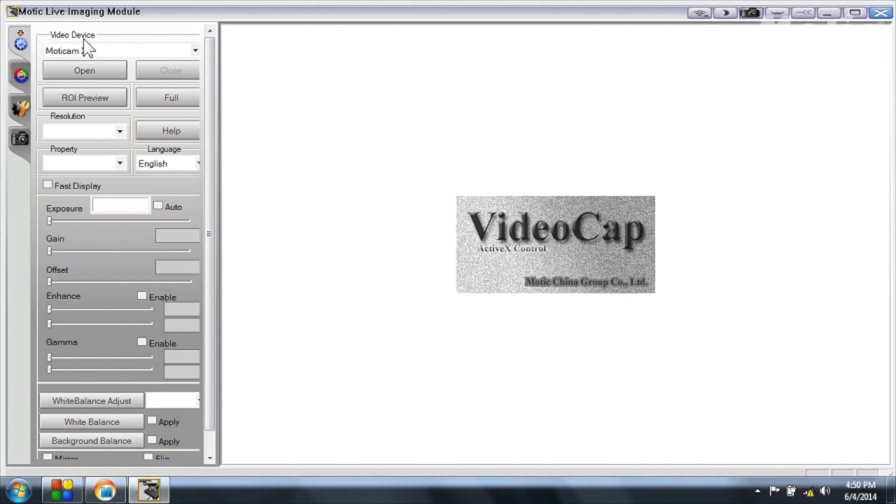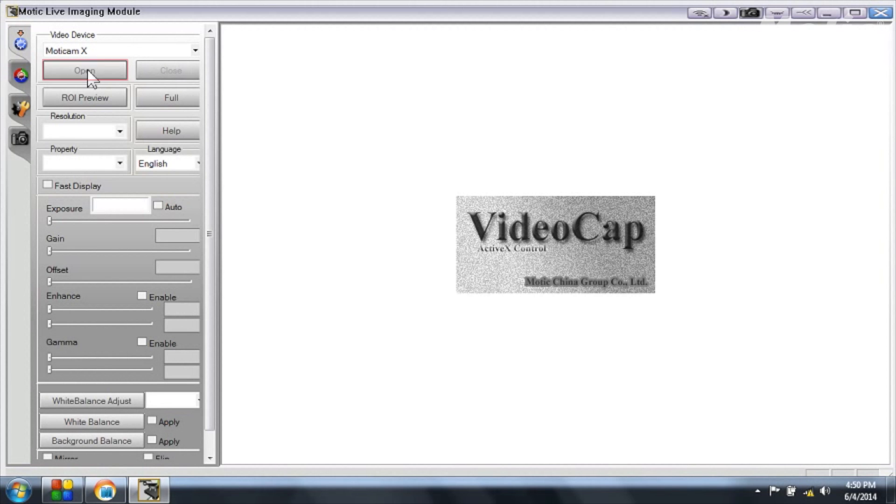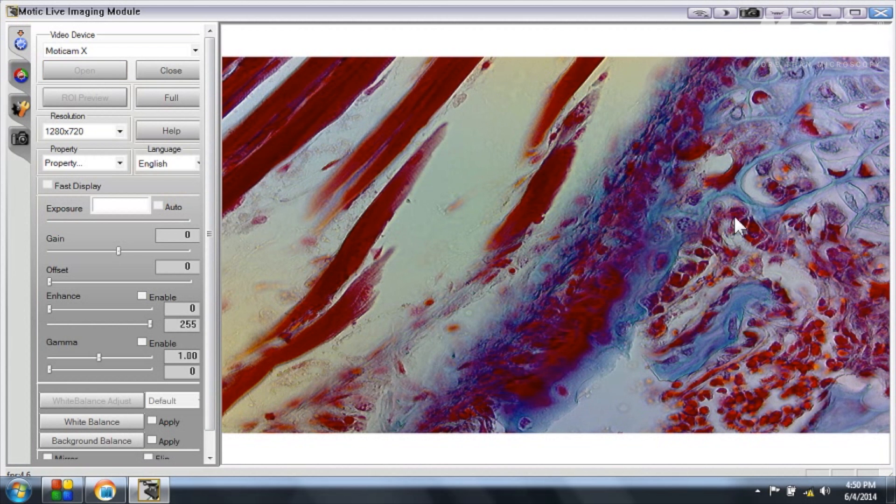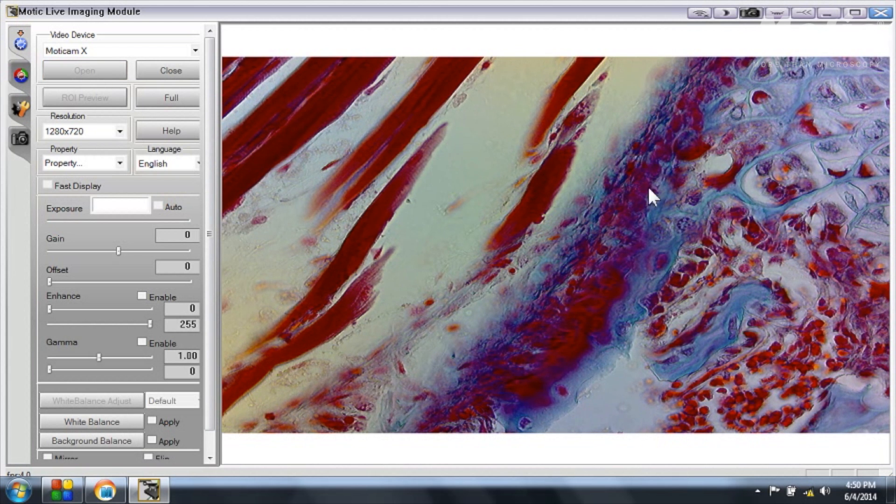You can see that in video device Modicam X appears. And now I simply click on open and straight away I get the live image of what the camera is capturing.